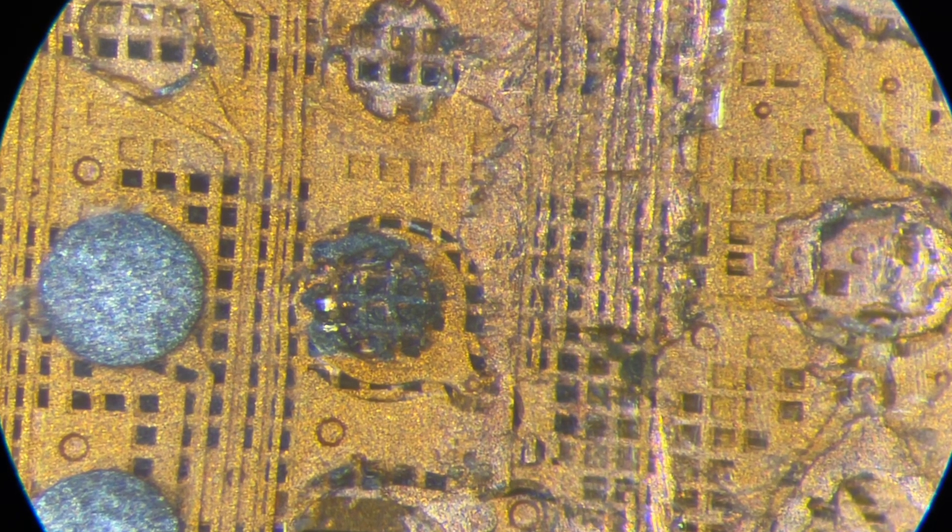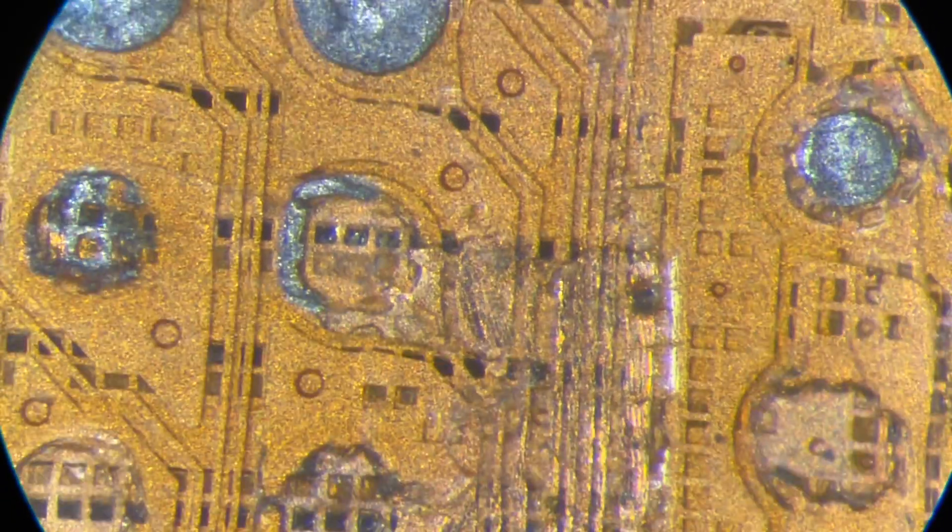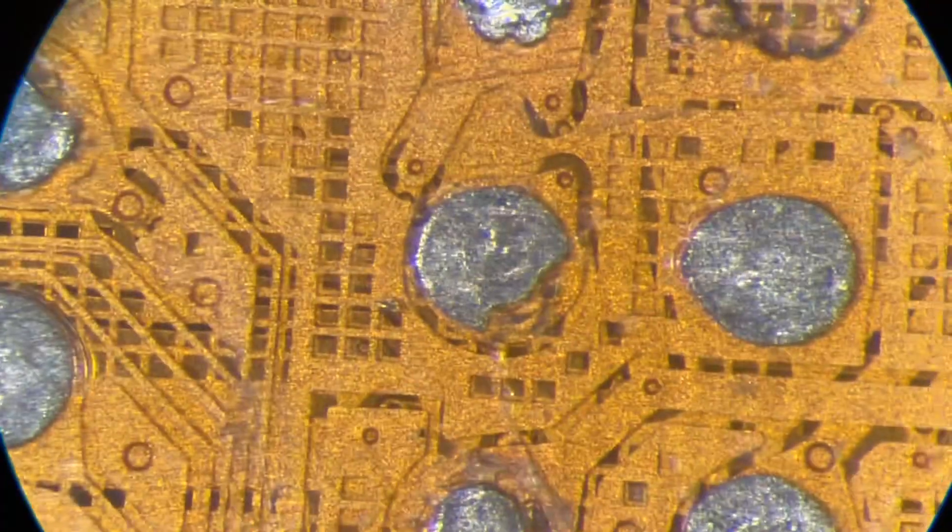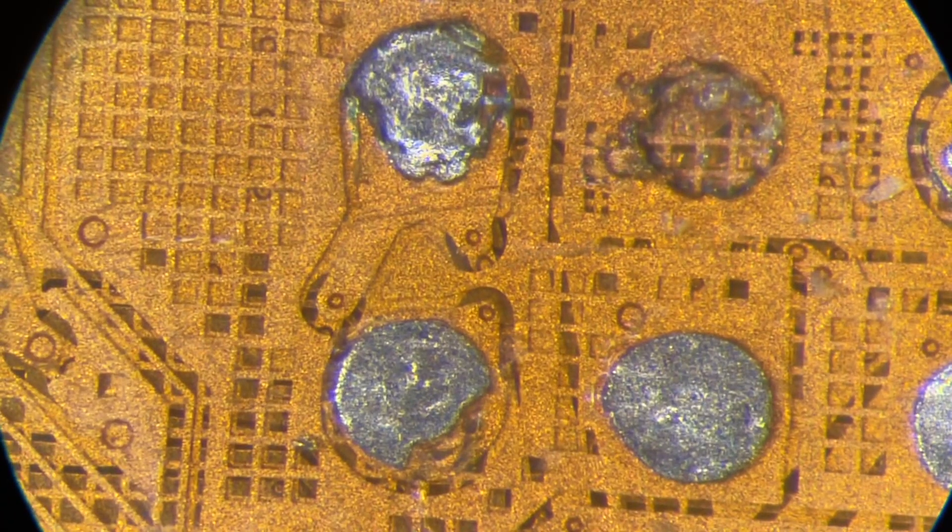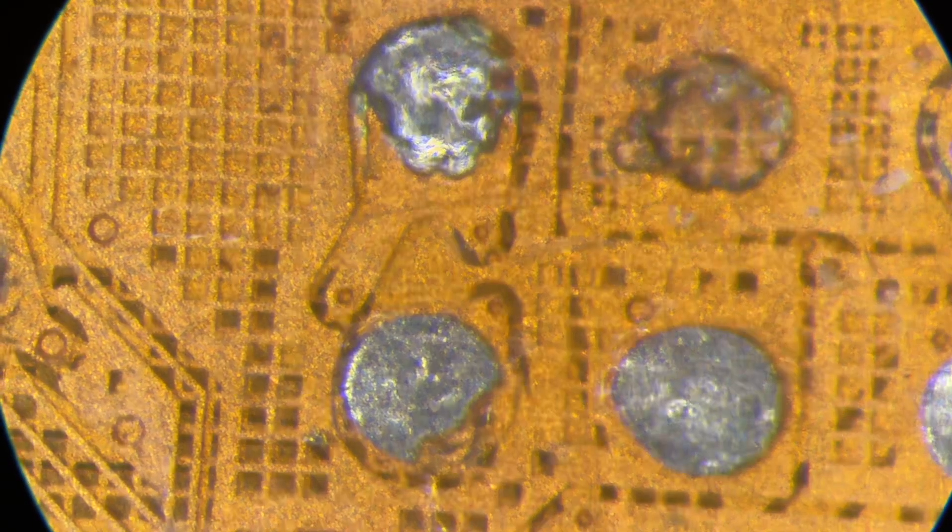We're slowly moving over the processor. You can see different structures and different defects made by Maxim from Herson almost three years ago.